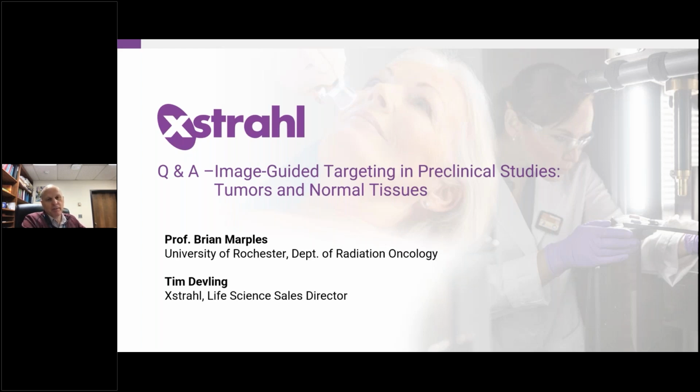As you can see from the image, I think that's Gary Hannon's work, with that image, you have to do surgery, implant the tumor cells into the pancreas, then put on the fiducial clips. So it's a surgical procedure. But once it's done, you can then irradiate as many times or frequently per day as you like.